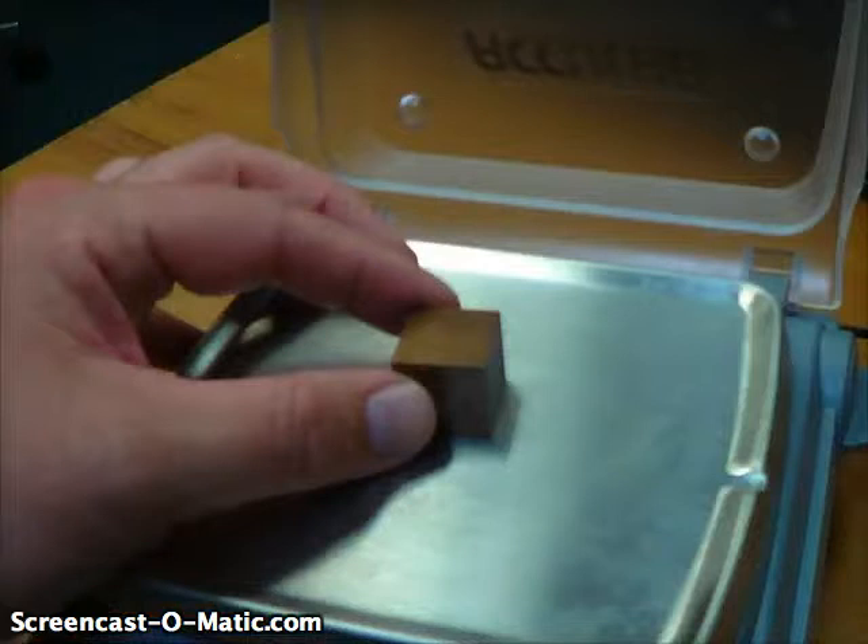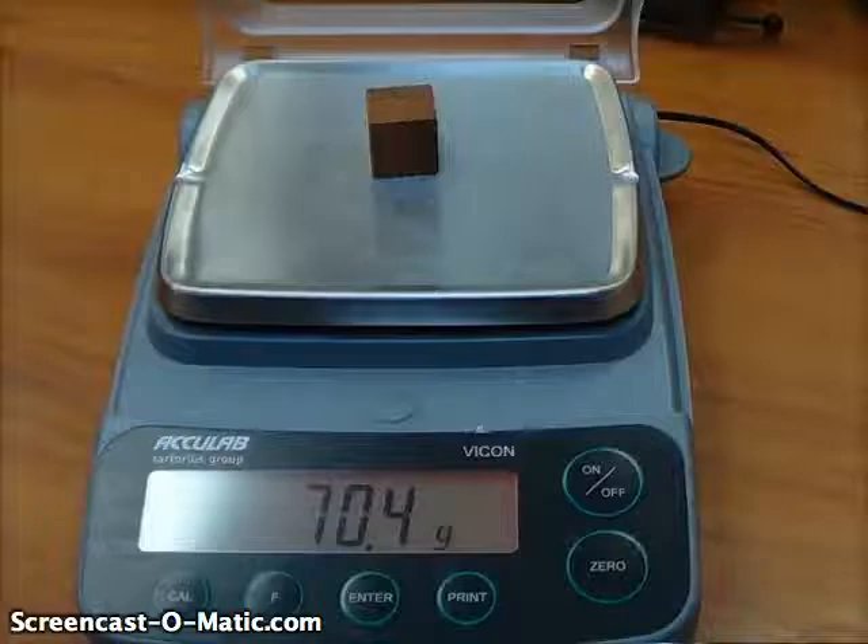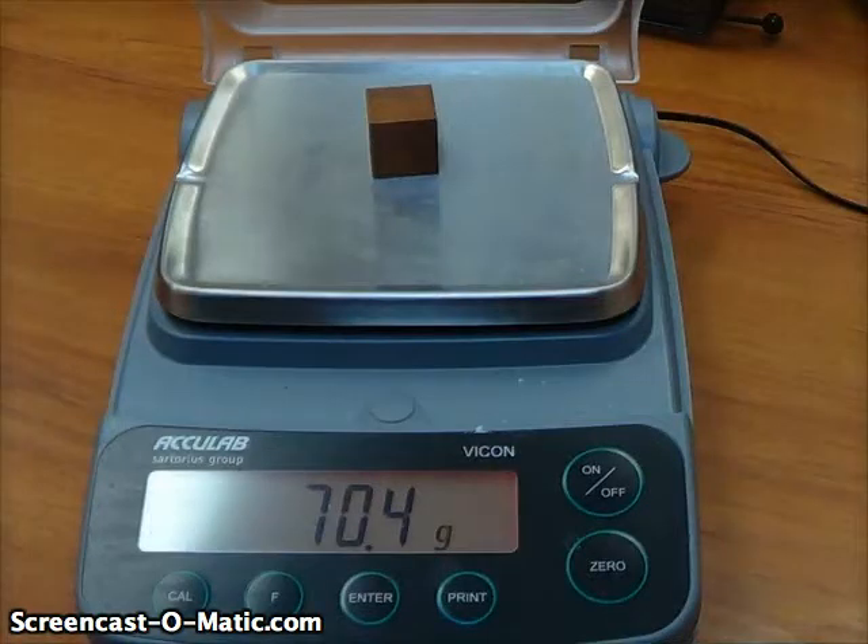Let's go ahead and measure the mass of this little metal cube. You set it on the tray, remove your hand, and the balance will tell you the mass. In this case, the mass is 70.4 grams.